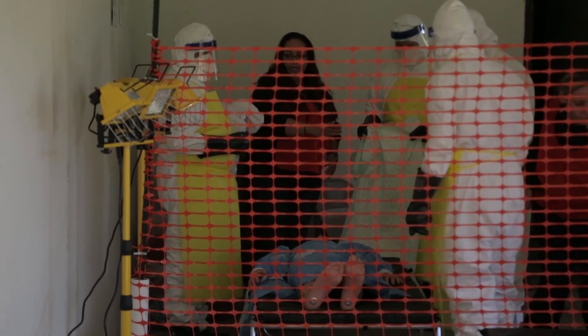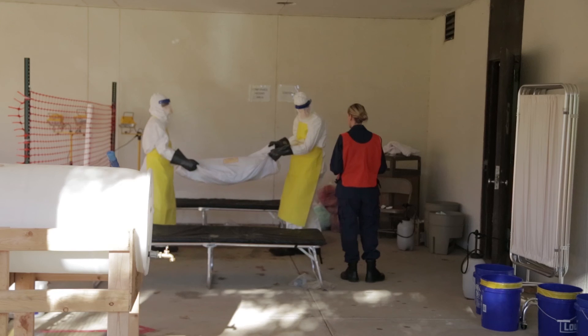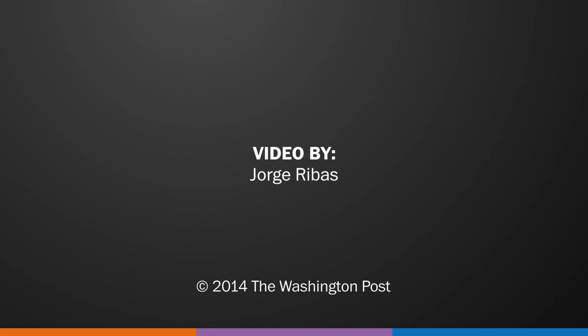That is the step in the donning process for putting on personal protective equipment, modeling the practices that may be in place in West African Ebola treatment units. All right. Thank you.